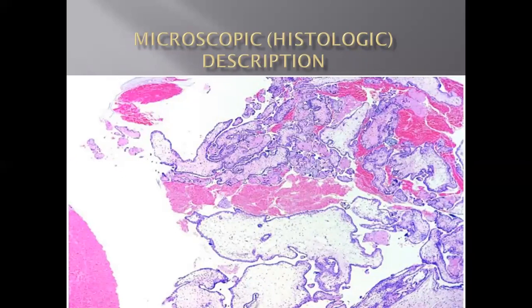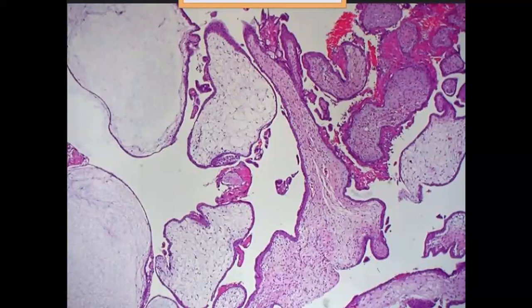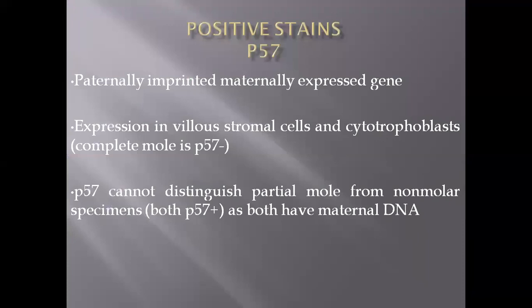The two distinct villus populations are a histological hallmark of the partial mole — not a feature of the complete mole. There is also focal hyperplasia of the trophoblastic tissue, visible in this slide as a large villus with abnormal borders and focal trophoblastic hyperplasia, in contrast to the complete mole which shows circumferential and more extensive trophoblastic hyperplasia. If the pregnancy extends beyond the first trimester or 14 weeks, some nucleated RBCs or capillaries may be seen in the villi due to the fetal component.